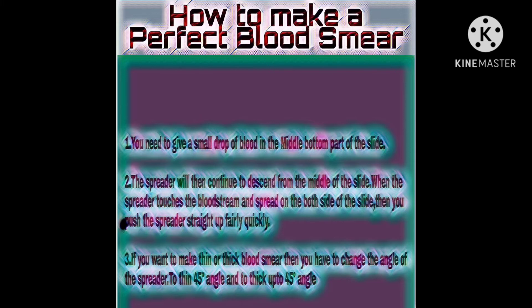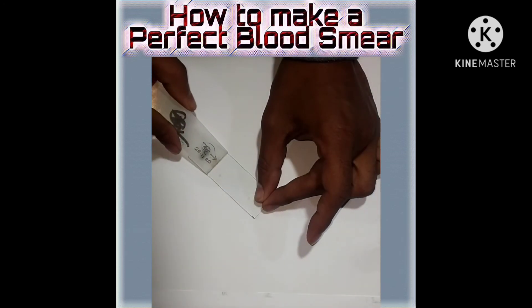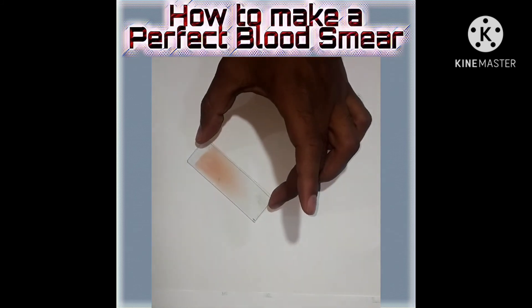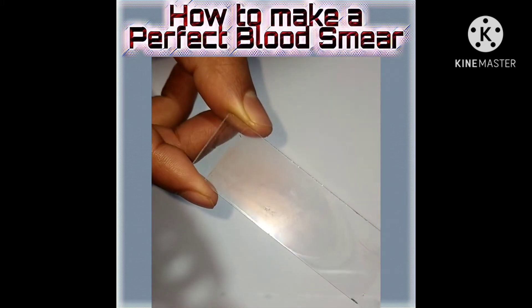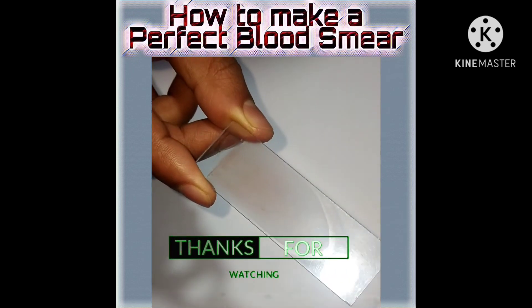Number three: if you want to make a thin or thick blood smear, you have to change the angle of the spreader — to a 45 degree angle for thin, and up to 45 degrees for thick. Watch the video to see how easily I did it. If you don't practice, everything is difficult — try and you will too. I hope this video will help you to make a perfect blood smear.